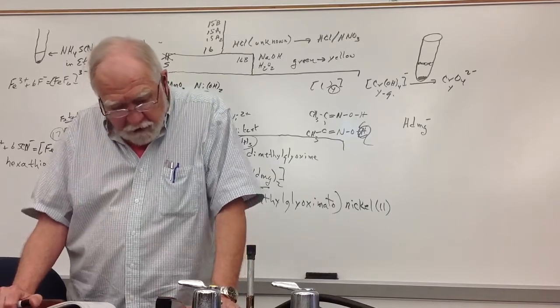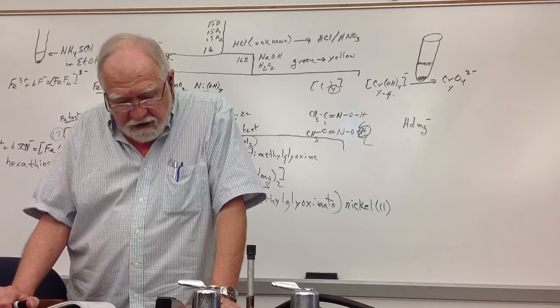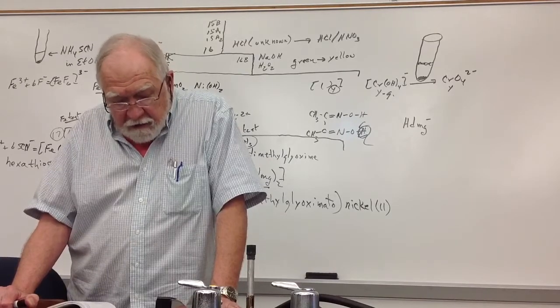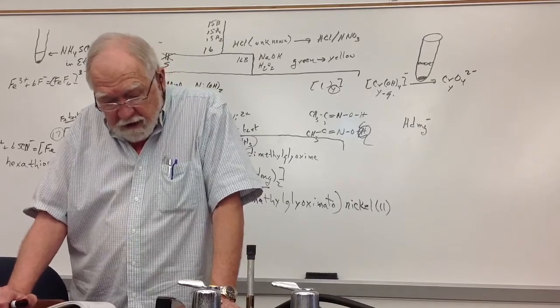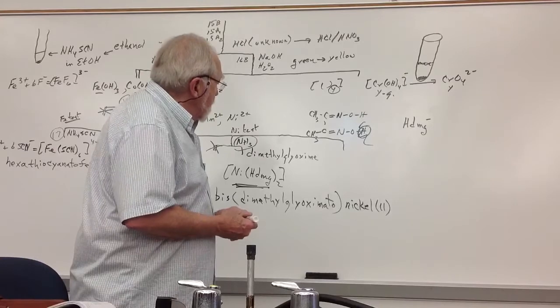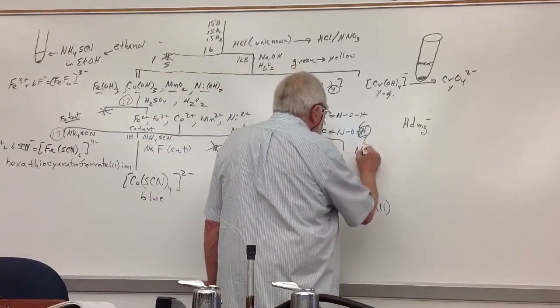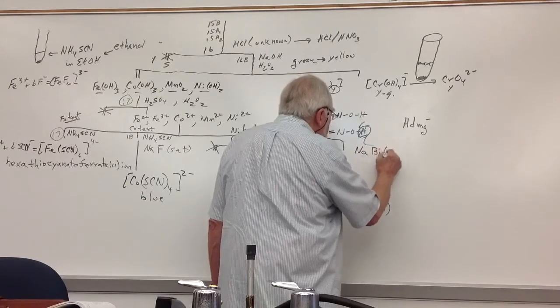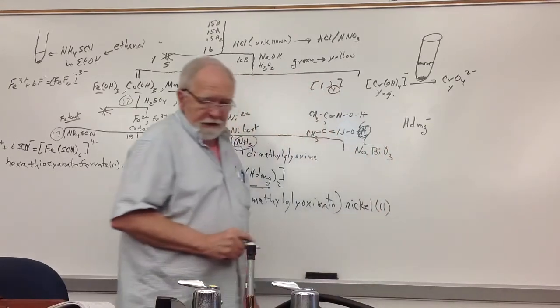Fourth part, you dilute it with water. You add 3 molar nitric acid, make sure it's acidic, and then you're adding sodium bismuthate. It's another solid, so it says a few grains. In other words, a little bit on the tip of the spatula. Again, you want to form a saturated solution. Sodium bismuthate.